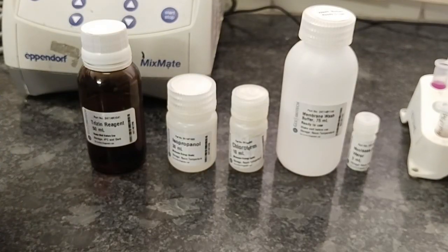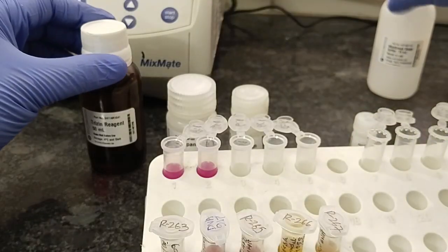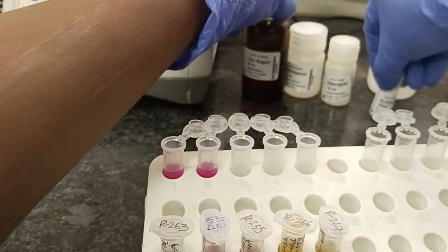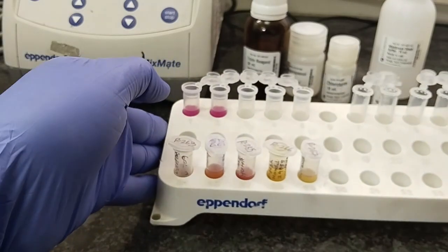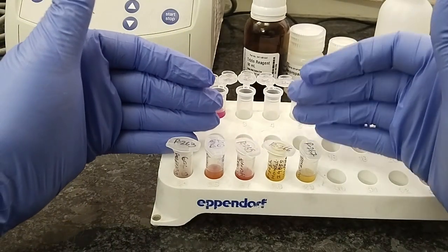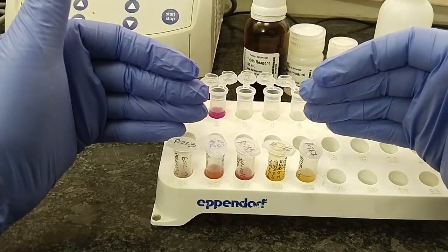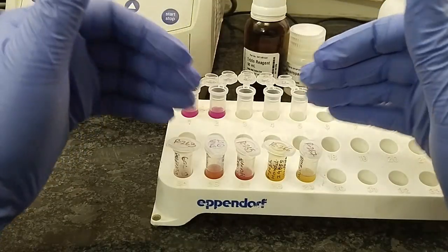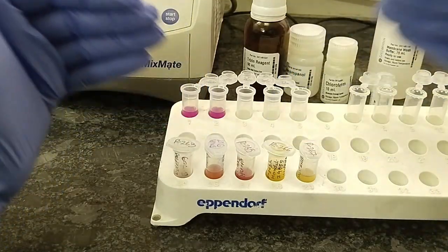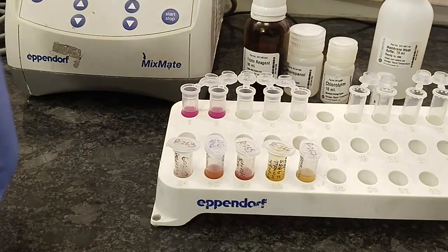So we have collected 5 samples. All samples are tested positive for HCV antibody serology. All are HCV positive. So here, from this test, we can demonstrate or calculate the viral load.